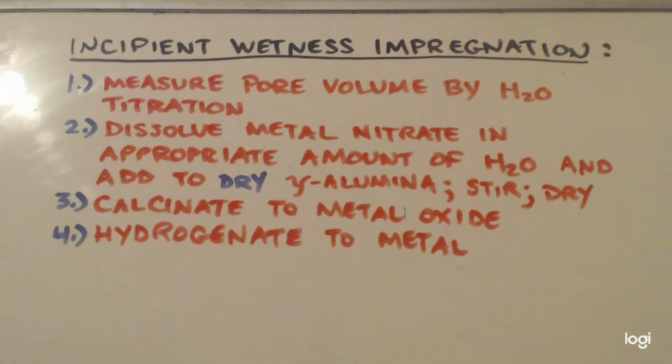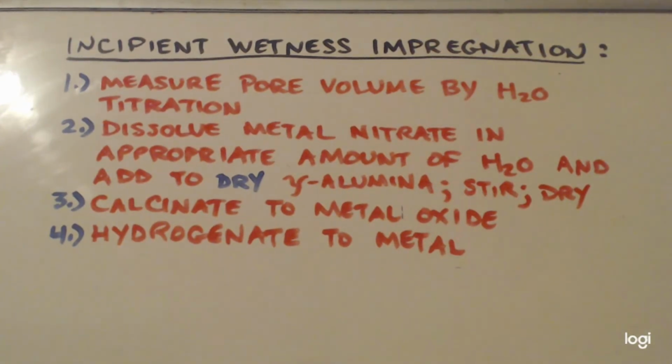The last thing I'm going to go over in this video is how my apparatus is going to change, because I'm not going to use the same apparatus I used in the video, because I'm going to be putting the flow rate up high. Remember, in the video I went really slow. This next time I'm going to do it super fast, and therefore I will need more cooling at the other end of the furnace to make sure that I don't lose any of the product. You know what I mean? So I will draw a picture of that and show you here in a second.